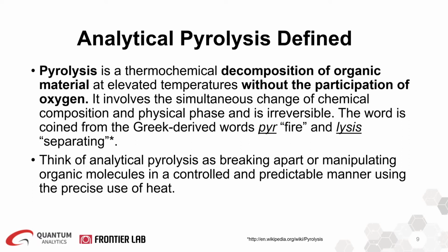It is very important to mention that applying the sufficient amount of heat and identifying the appropriate temperature for programming the pyrolyzer's furnace are critical factors in the pyrolysis technique. And as we go more into details, you'll find out how to identify that sufficient amount of heat so you're not over or underheating your samples.